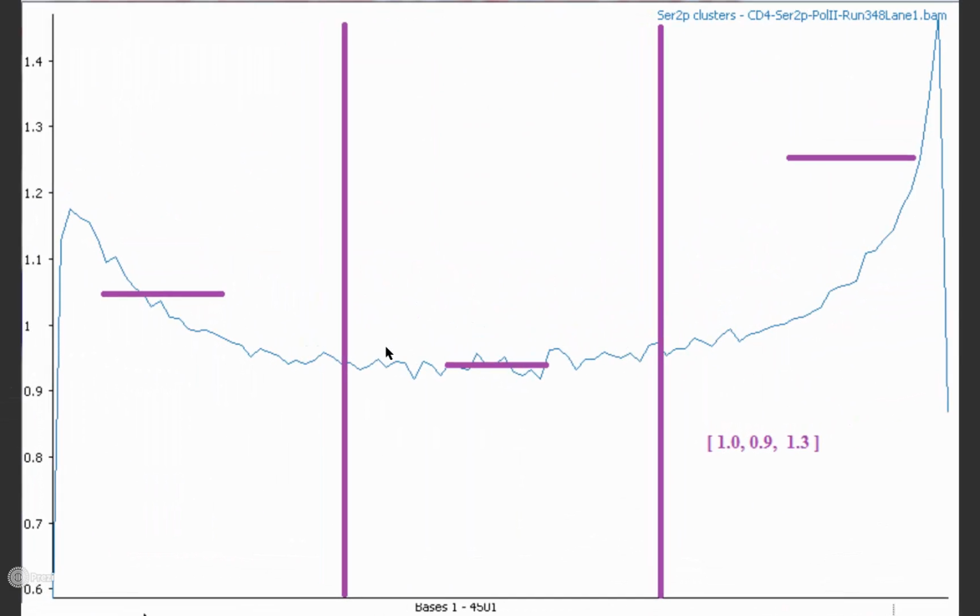To work with continuous or pseudo-continuous data, like our gene probes, we need to discretize it. To do this, we can break our probes up into bins, and we can find the average number of reads per bin.